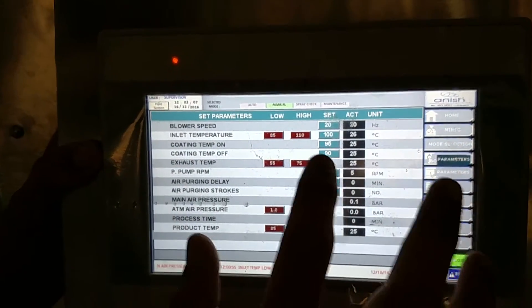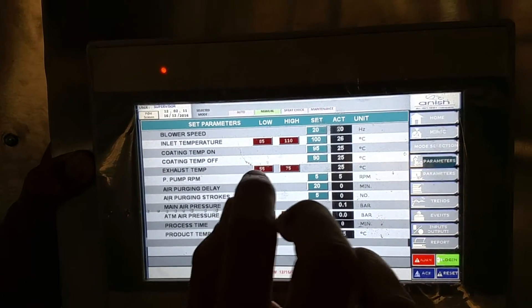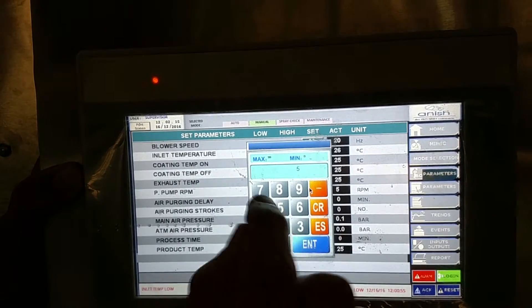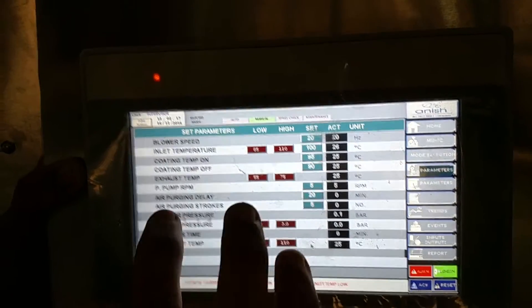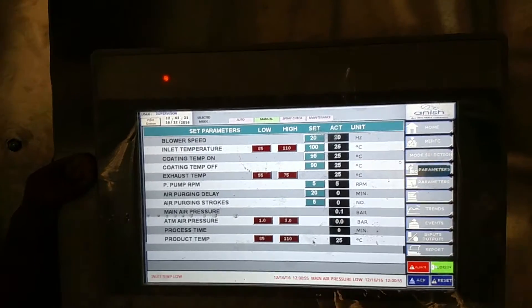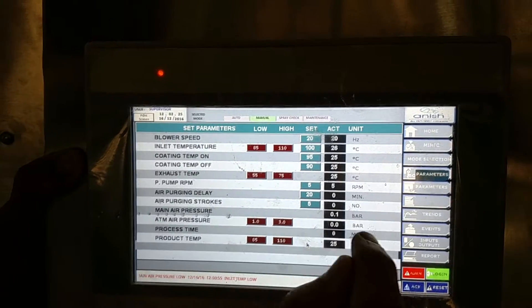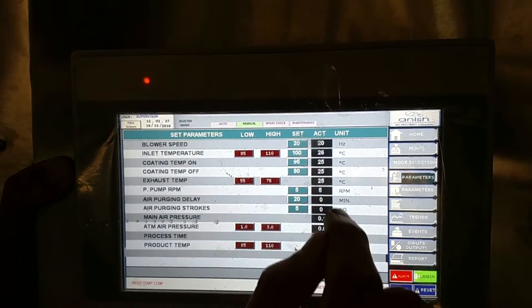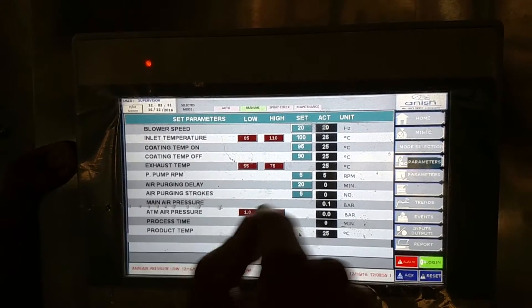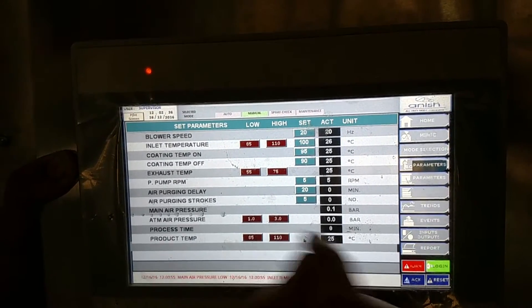Then exhaust temperature — exhaust temperature cannot be set because it is in the recipe. Exhaust temperature maximum and minimum limits we can set. Then pump RPM is set as 5. Air purging delay: after 20 minutes of delay, the air will purge 5 strokes. So after 20 minutes, 5 strokes of air will be purged into the system, and after every 20 minutes the cycle will repeat. Minimum air pressure — atmospheric air pressure is taken from the compressor and is automatic.